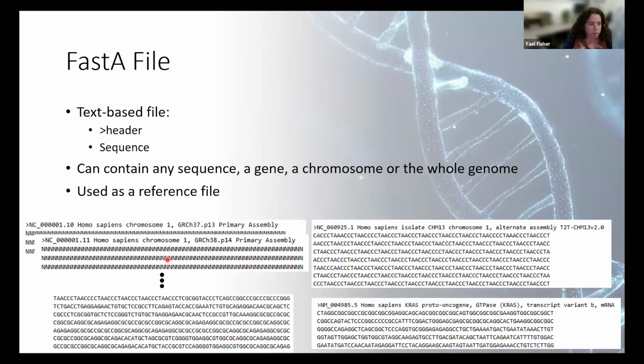These 2 start with a long sequence of Ns. N means that the nucleotide is not identified. And in GRCH37 and 38, the full sequence of the telomeres was not available yet. But if you scroll down in these files, you'll eventually get to a spot where you can see the actual sequence. In the T2T assembly, you can see the actual sequence right from the beginning.